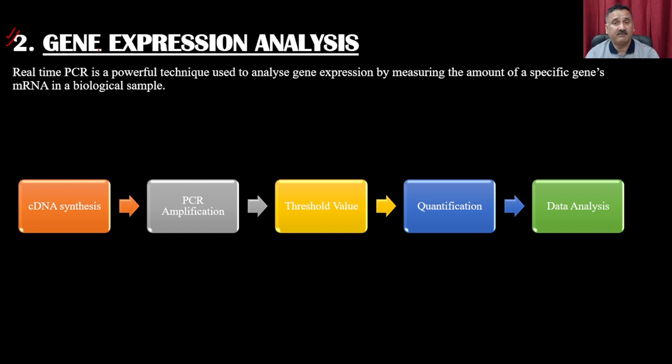So, I am sure when we were discussing the real-time PCR, we showed you a complete demo of how you can do gene expression profiling. We are not going to discuss this in detail. The real-time PCR is a powerful technique to analyze gene expression in a biological sample.